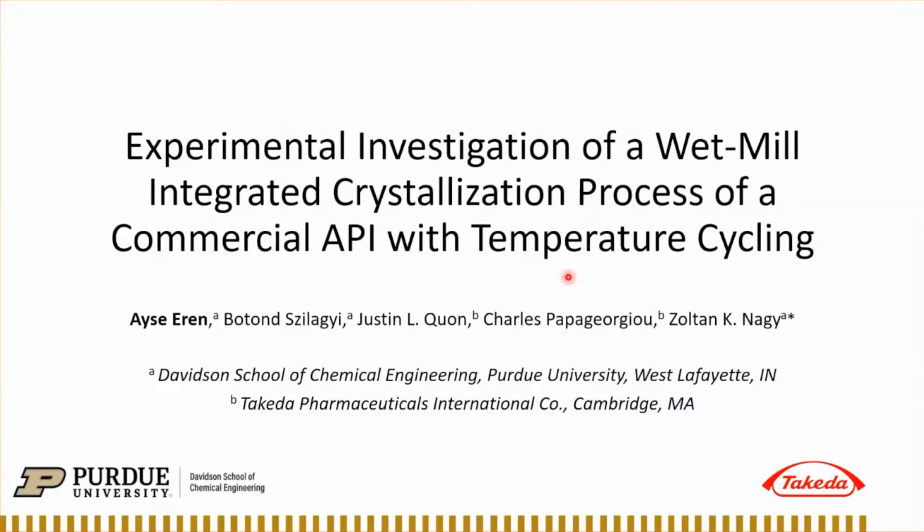In this presentation, I will walk you through an experimental proof-of-concept study on a wet mill integrated cooling crystallization process of a commercial pharmaceutical ingredient.